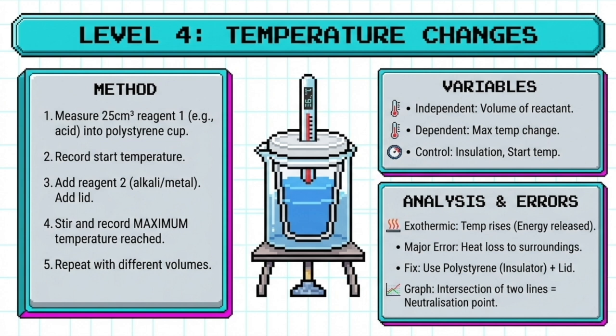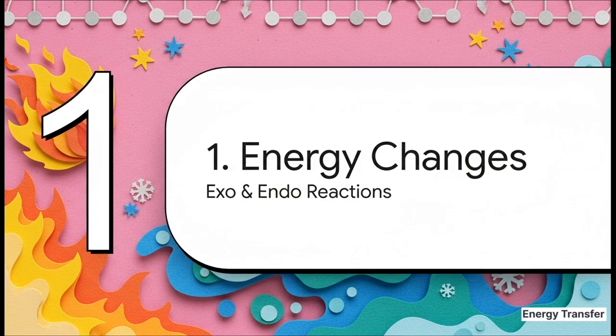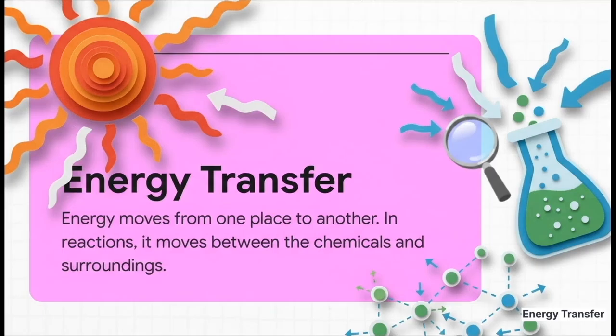All about investigating temperature changes in chemical reactions. You need to know that every single chemical reaction involves some kind of change in energy. So, at the very heart of this practical is this idea of energy transfer. Just think of it like this. Energy is either moving out of the reaction into its surroundings, or it's being pulled in from the surroundings.